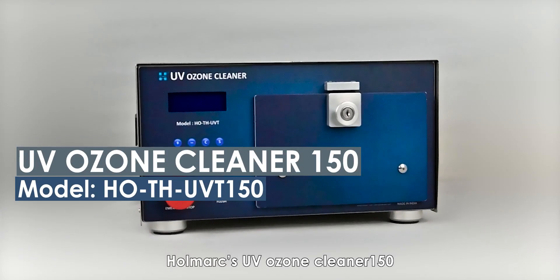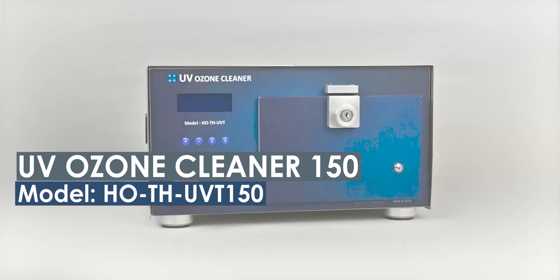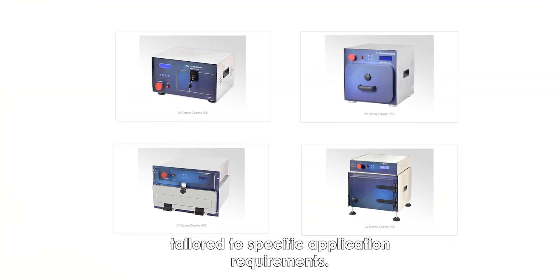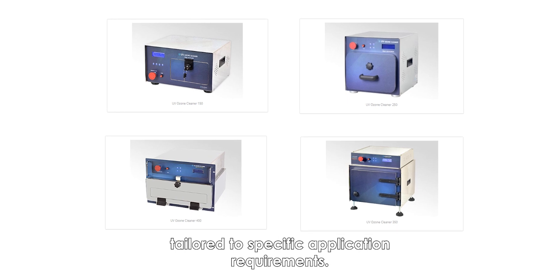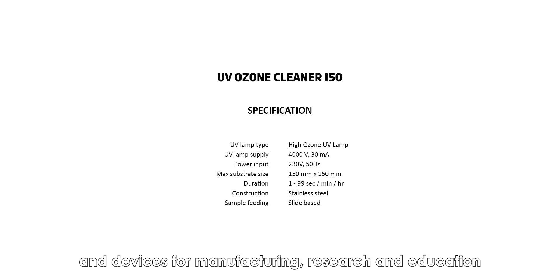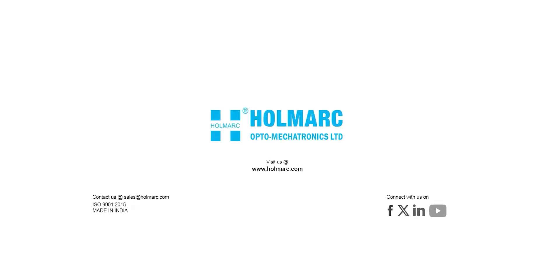Holmark's UV Ozone Cleaner 150 — Holmark offers various UV ozone cleaners tailored to specific application requirements. Holmark manufactures a wide range of scientific instruments and devices for manufacturing, research, and education. Visit us at www.holmark.com and contact us at sales@holmark.com. Order your products now.